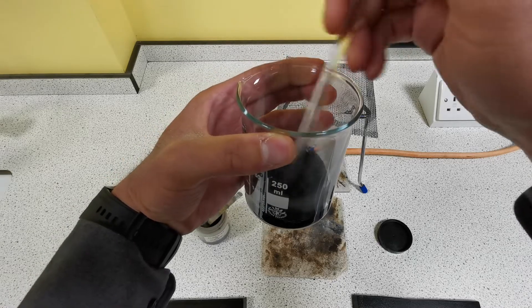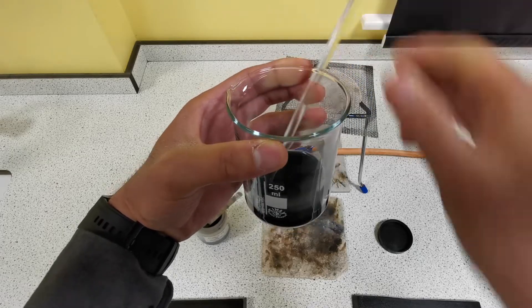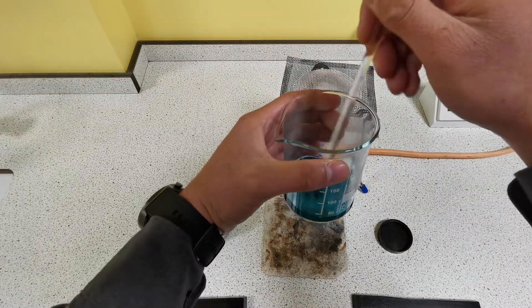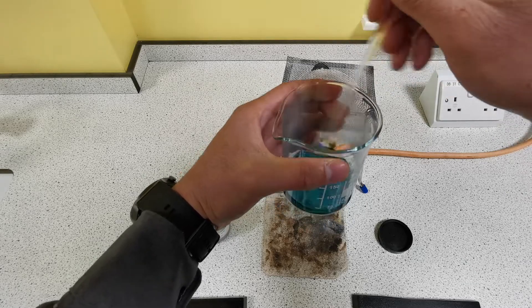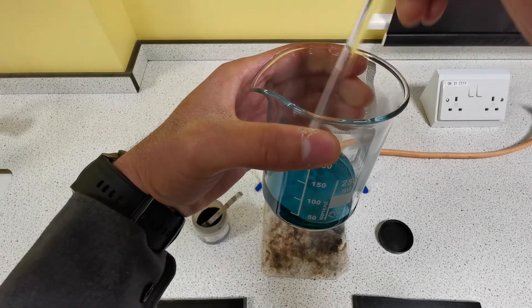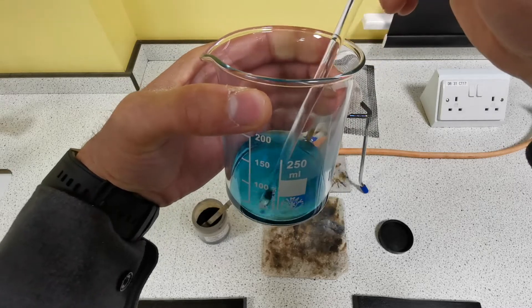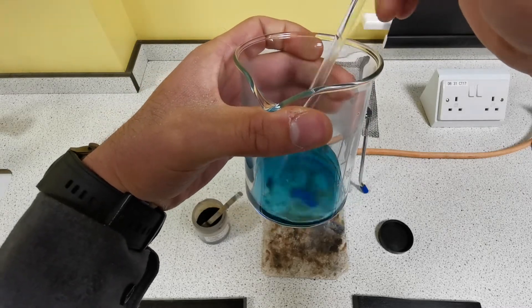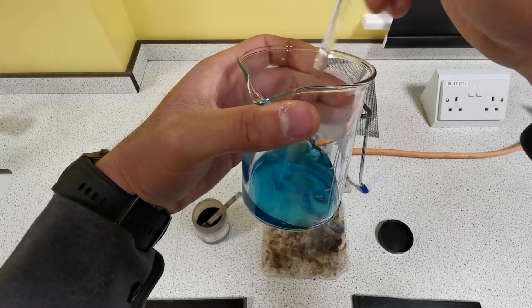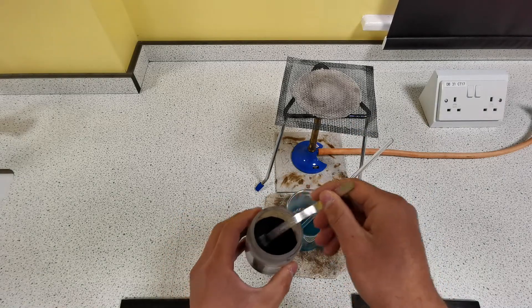Keep stirring. Eventually the solution will start turning blue and all of the black copper oxide will disappear — that's because it's reacted with the acid. It hasn't dissolved; it's reacted. You can see in the bottom of the beaker there isn't much copper oxide left — in fact, now it has all reacted. So because it's all reacted, we want to go ahead and add another spatula of copper oxide.